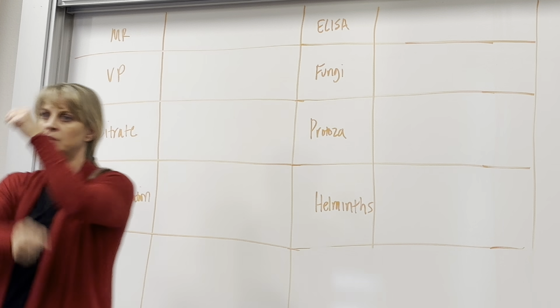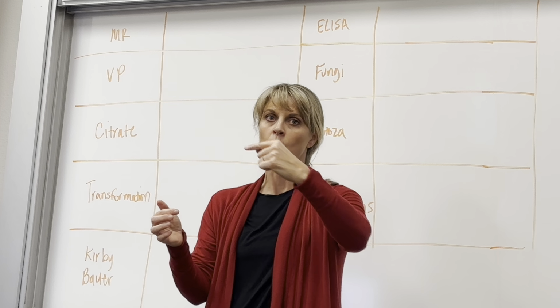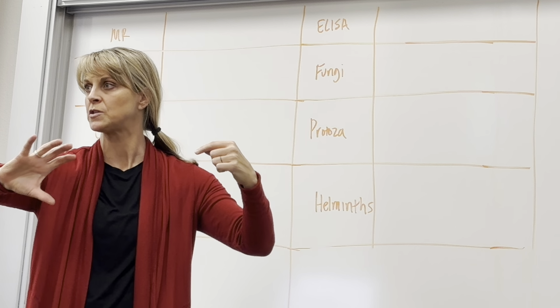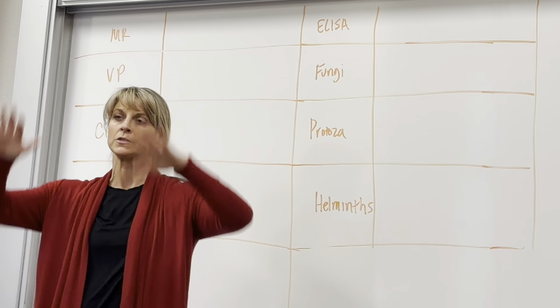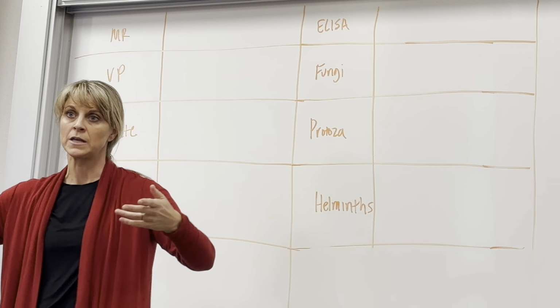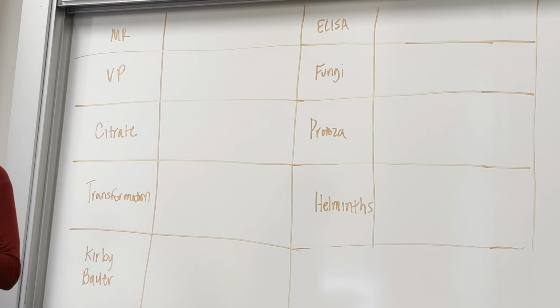You turn the big wheel and it rolls out your shelf, and you follow your course number and there are all your agar plates that you've been working on. They have a big giant incubator with plates and plates of everybody's work, and they try to keep them all in the same incubator. You have to check in and check out before you get in there.